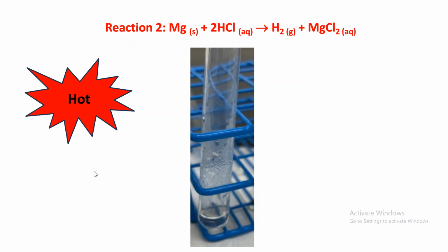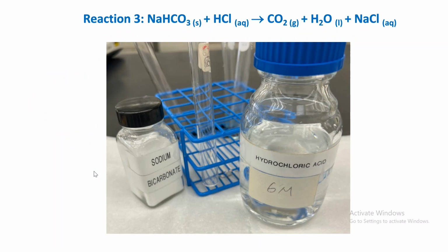Very hot, as you saw. It's getting extremely hot. So again, is this exothermic or endothermic reaction? Two is also exo with an X, exothermic reaction. All right. The next experiment, everyone, write down your observation.